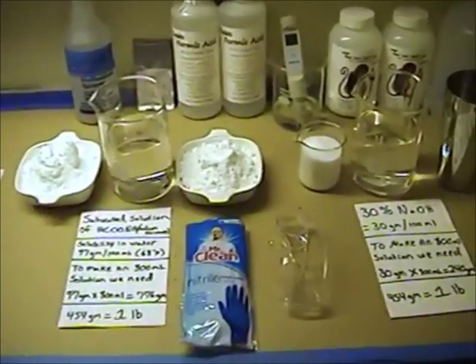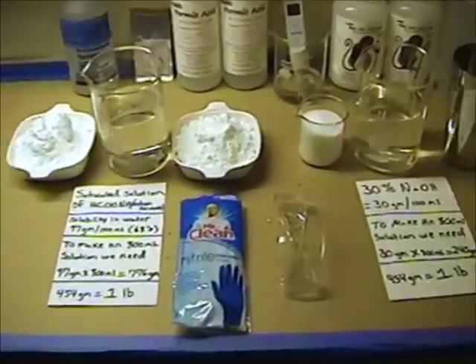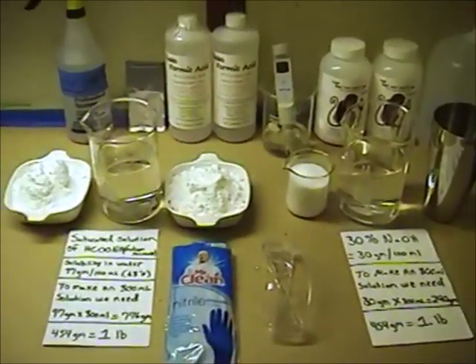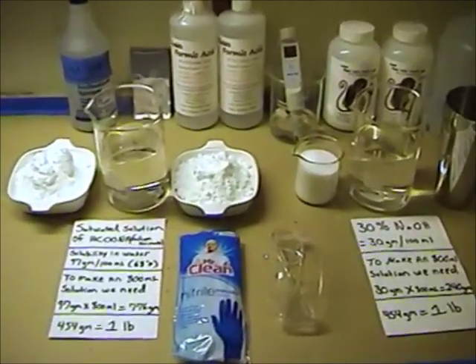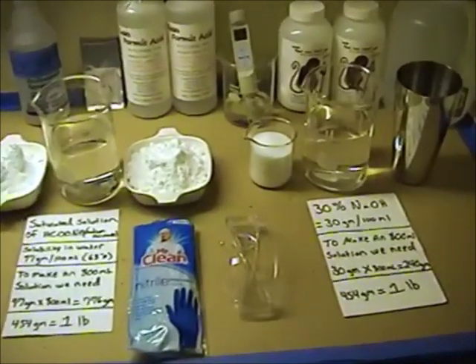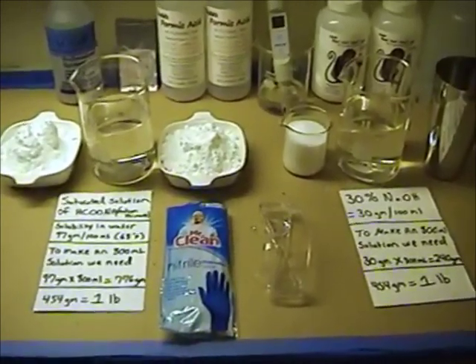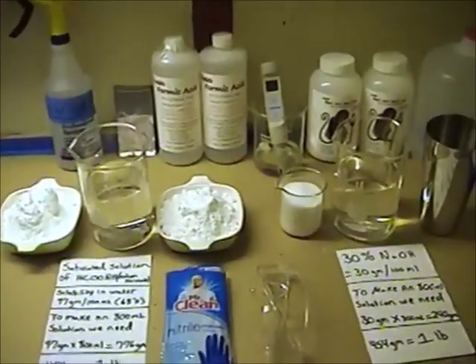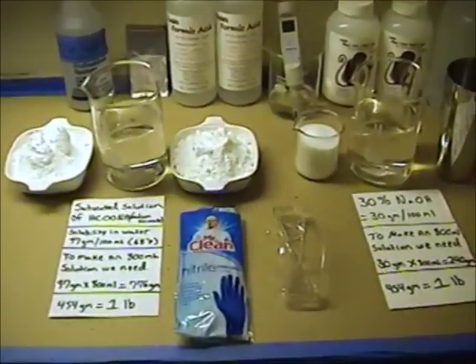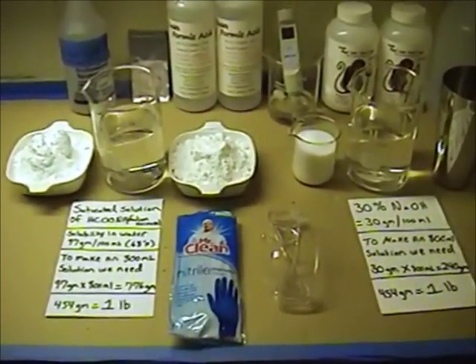Now this process affords you several different things that you could use according to what material you're trying to process. But the number one thing is speed. This is not like cementation, and this is not like the silver cell. This should be a fast, accurate, quality product that we're going to produce. But I've never done this experiment before either, so that's the whole purpose of doing it. Then we're going to test it and see if it'll work. So I'm going to cut away now, and I'll get back to you gentlemen in just a few minutes.